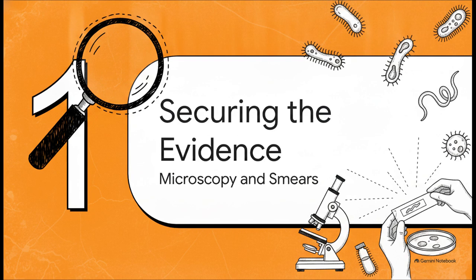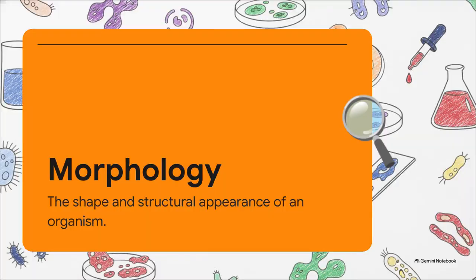Section 1. Securing the evidence, microscopy, morphology, and smears. Before we can start interrogating anybody, we need to bring them into the light and establish exactly what we're looking at. Okay, so the absolute crucial starting point is knowing the difference between the physical shape of a single bug, which we call its morphology, versus how the whole gang hangs out together, which is its arrangement. Think of morphology as the suspect's basic physical description. It tells us the structural appearance of the individual organism.